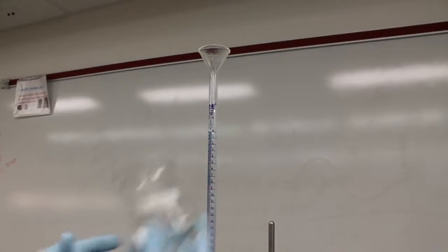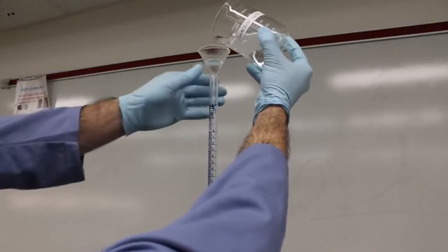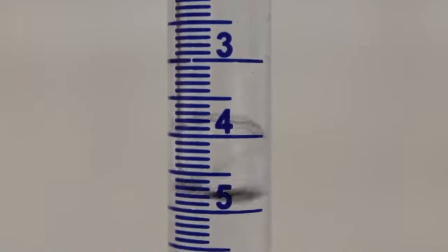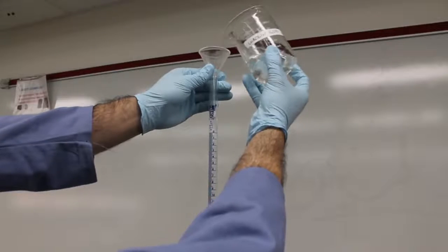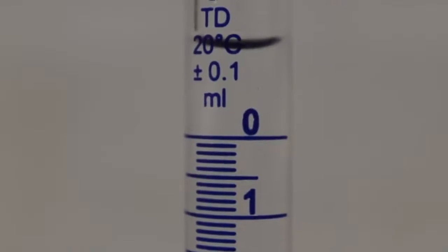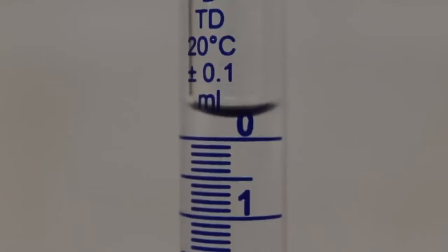Once you are fully rinsed, you can top off your burette with your titrant. Then you'll need to zero out your burette to get ready for your titrations. Remember, your initial reading does not have to be 0, but will need to be documented for your future calculations.